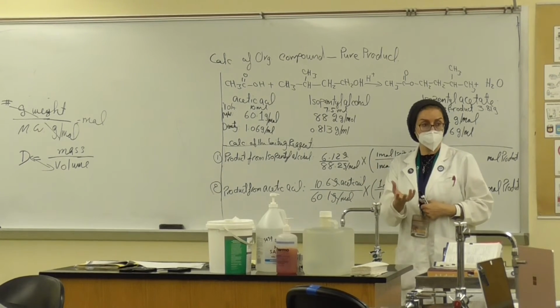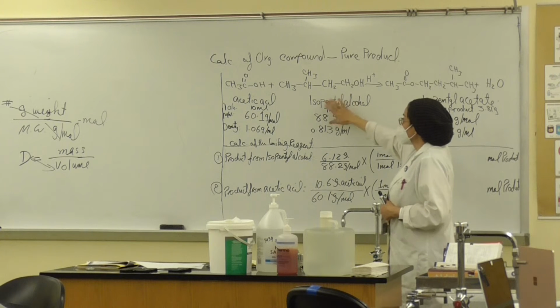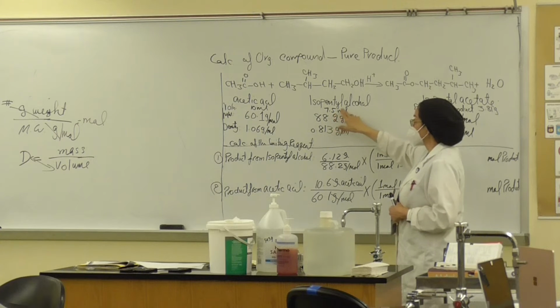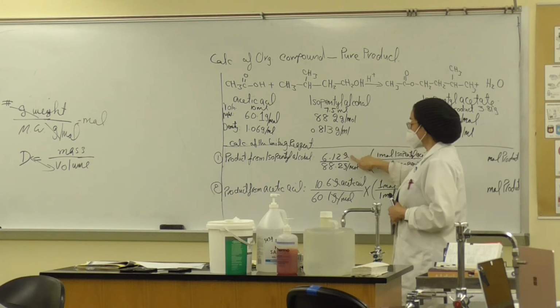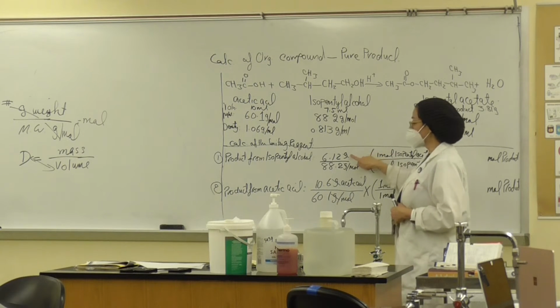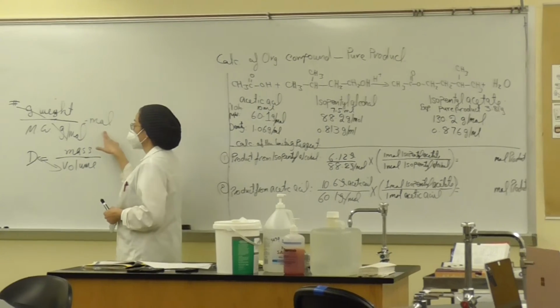That's how much we weigh in a starting material. The other one is isopentyl alcohol. We are going to measure 7.5 milliliters multiplied by 0.813. We got 6.12 grams. The second step is to convert grams into moles. How do we convert grams into moles?